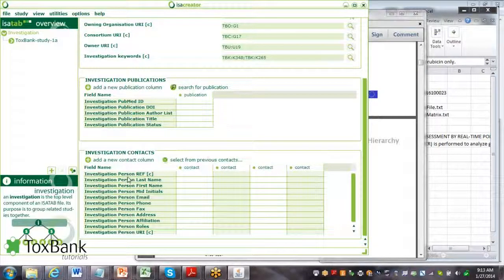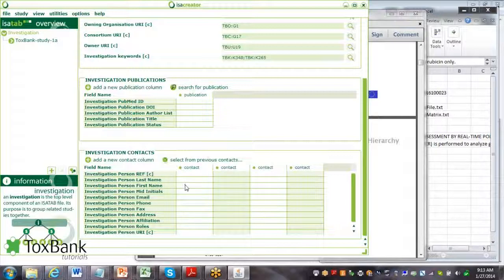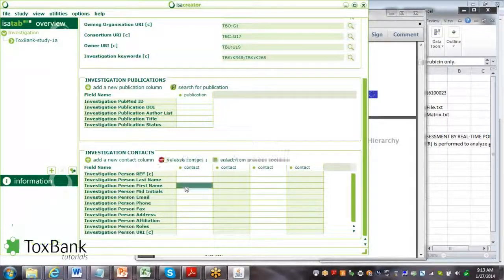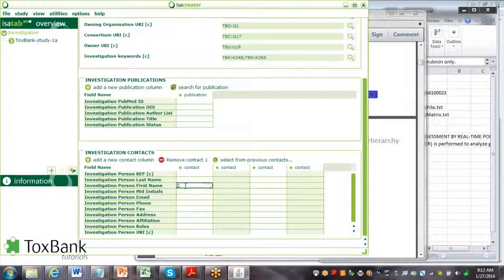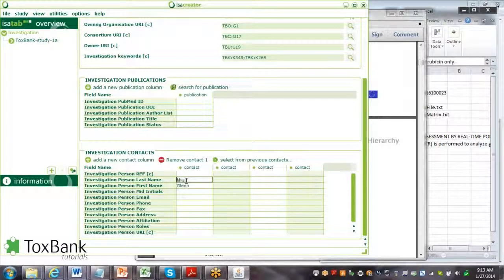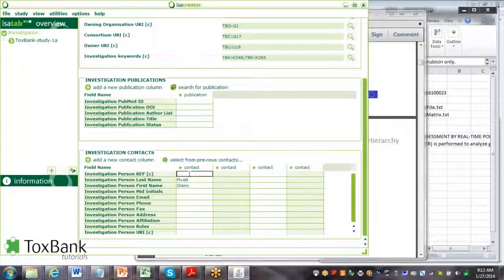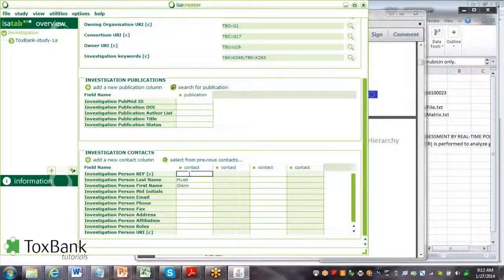Finally, what's important is to add the individuals that are authors of this investigation. You would add the first name, the last name, and if there's a reference.